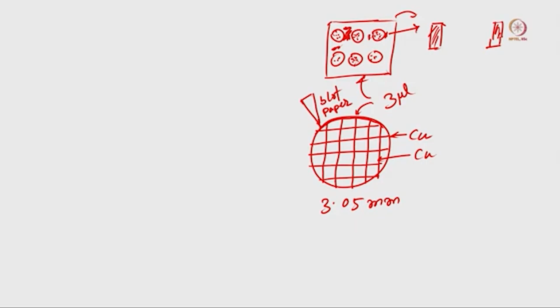or you can say liquid ethane. Liquid ethane's freezing point is around minus 180 degrees centigrade, so we keep the temperature near this and quickly plunge the sample into liquid ethane. When we do this, what will happen? The small amount of water buffer in the solution will freeze quickly, and whenever it freezes quickly, it forms an amorphous ice.